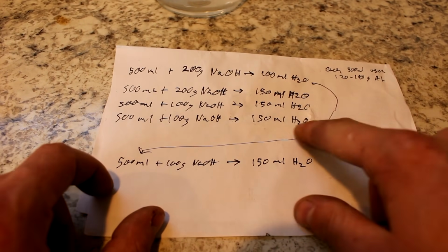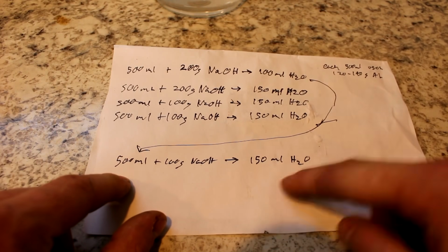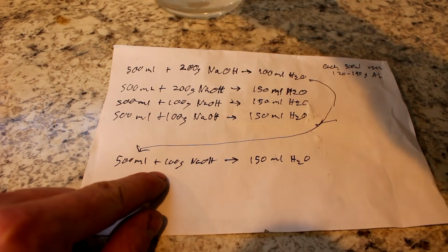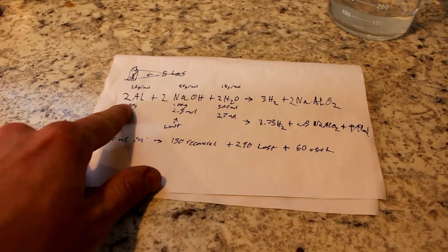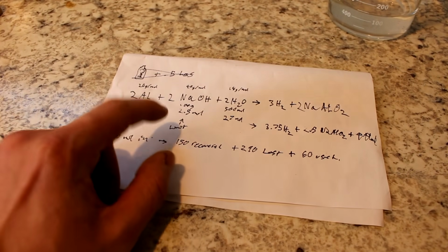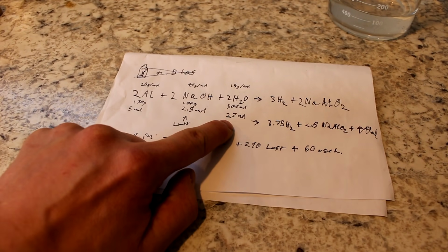So I combined all the waters together into 500 milliliters, basically did this once again with 100 grams of sodium hydroxide, and I gained this water right here. There we go. You see, I've got the equation here that was the chemical reaction, and the amount of each reactant that I had. You know, 500 milliliters, 27 moles. That's quite a few moles of water, yeah?